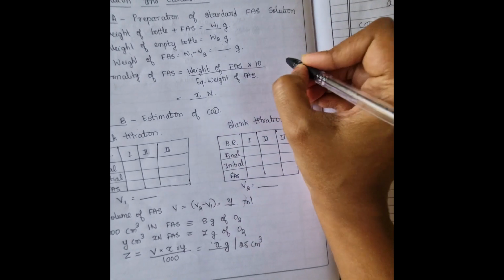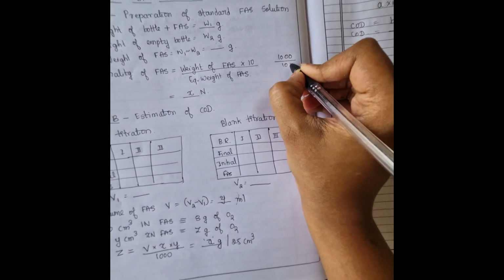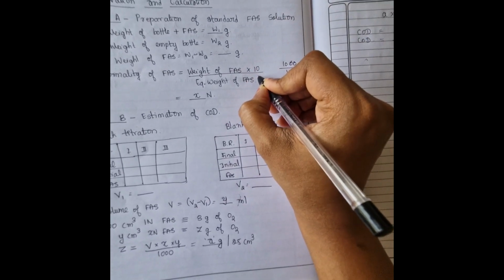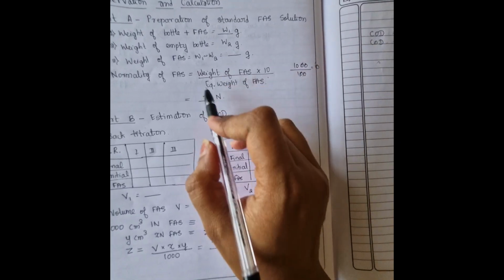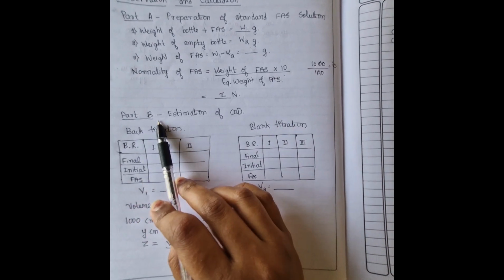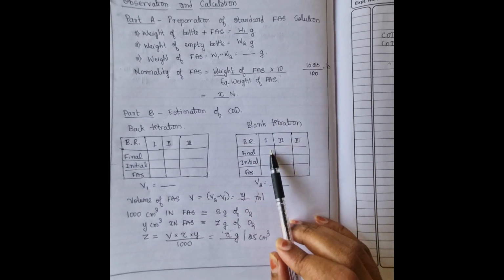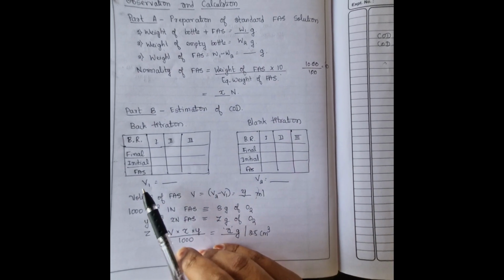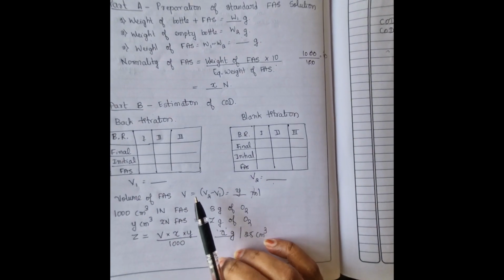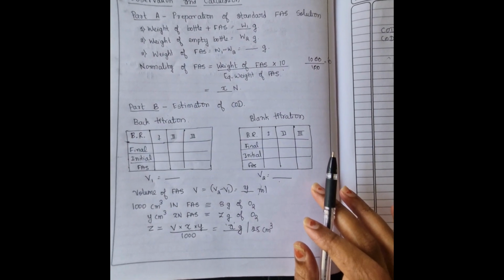How we got this 10 is, we are doing it for 1 liter, that is 1000 ml, but we are preparing only 100 ml of FAS. So cancelling 2 zeros, we get 10. That 10 is used here as the multiplication factor. Solving this, we get the normality of the FAS solution used for titration. Then in part B, we have the back titration with 3 concordant readings, and the blank titration. For both we take the average of the 3 readings as V1 and V2. Subtracting V1 and V2 gives us the exact volume required for the neutralization of potassium dichromate for COD.